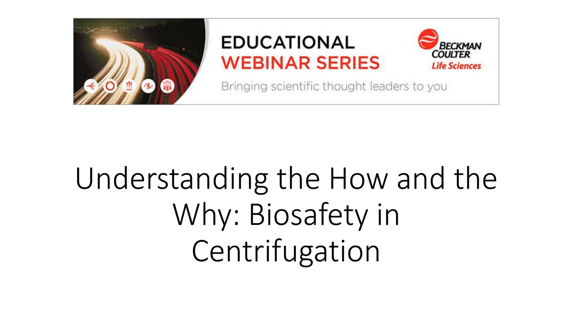Okay, thank you. Next question, what will be the general RPM of the rotor? Why is 0.2 G so important? Okay, I'll take first shot at that. 0.2 is tough, I know. It's not much of a difference, but again, keep in mind that 0.2 usually relates to swinging bucket rotors, ultracentrifuge swinging bucket rotors, which have forces well over 100,000 Gs. So that 0.2 times 100,000 now is significant.